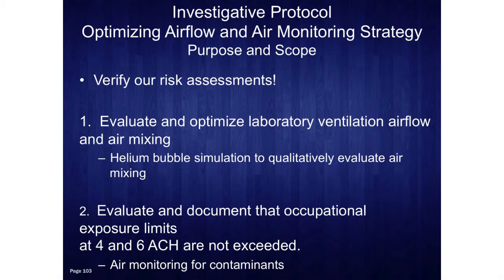But for right now, what we're doing is we're evaluating and optimizing the laboratory for airflow and air mixing, and we're using a helium bubble simulation machine, which I'll just show you in a second. And also, we're making sure that there aren't any overexposures to chemicals in the lab, both at 4 and 6 air changes.